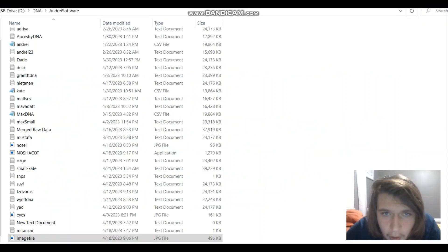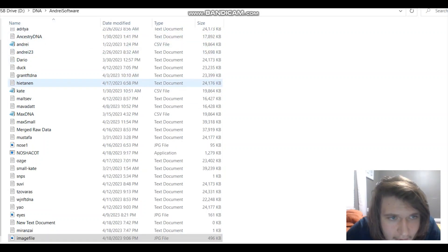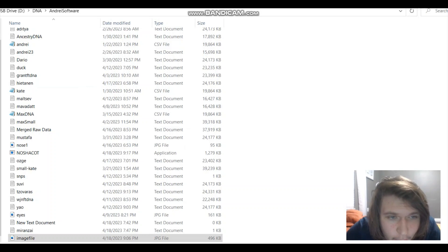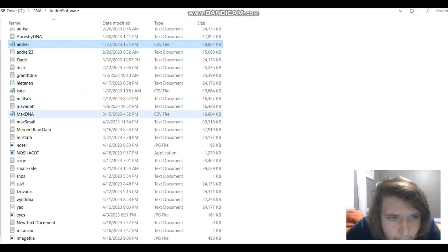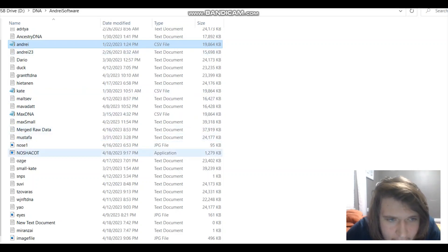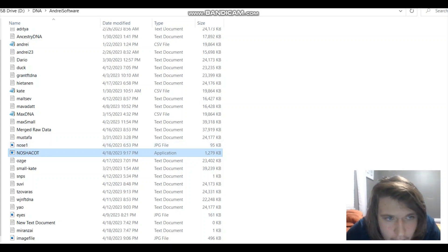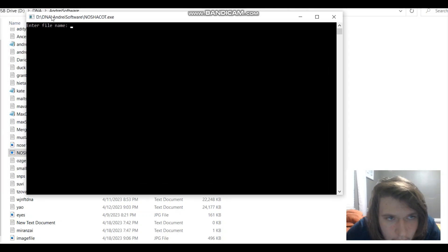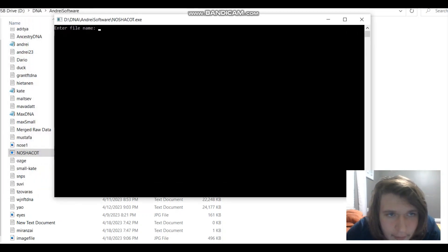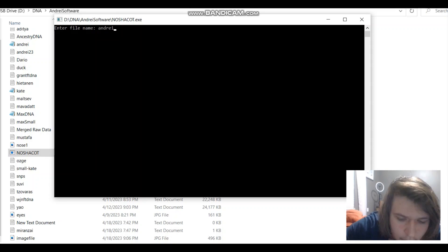Now I will show you how to run it. So, this is my folder. Basically, I have a bunch of DNA files in my folder and you want to have your DNA file. So, this Andre would be my DNA file. It's CSV format from MyHeritage. You want to have it in the same folder as the actual tool, as the executable. That's very important. So, we open the executable. Enter DNA file name. We're going to enter my file name, that's CSV.